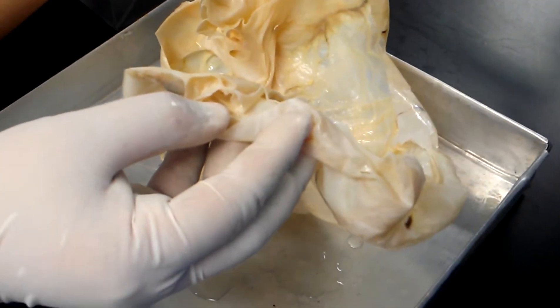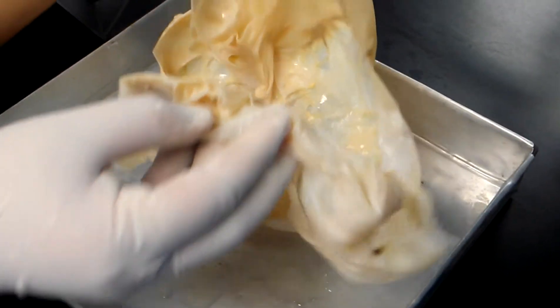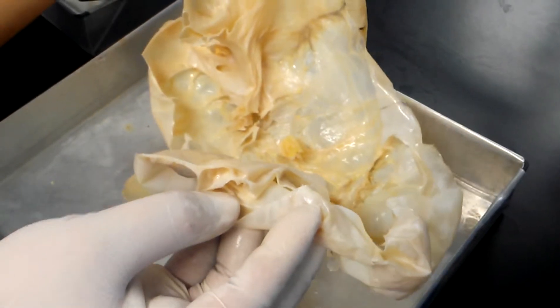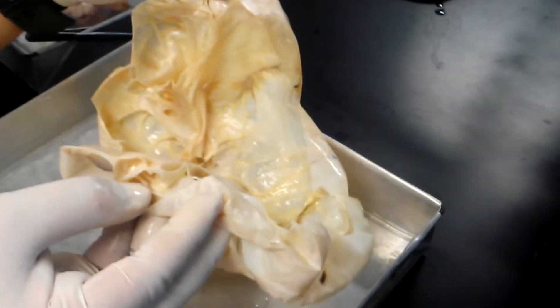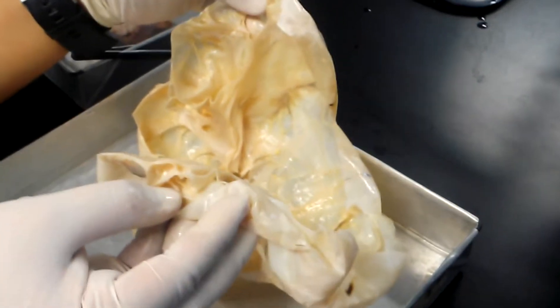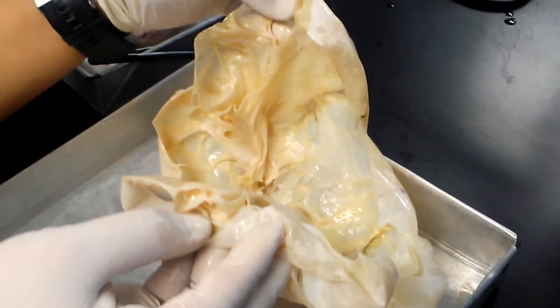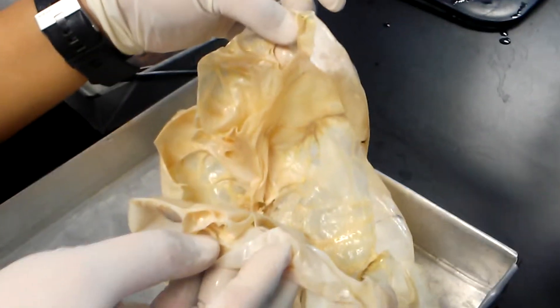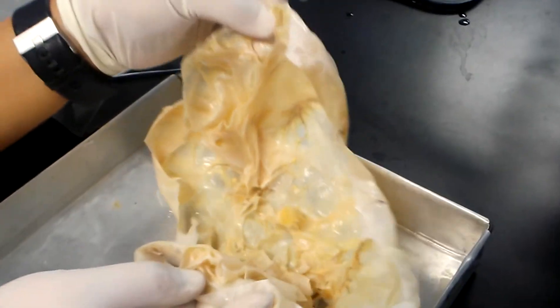But in the real specimen, when you open this up, you will appreciate clear to gelatinous serous fluid or material.